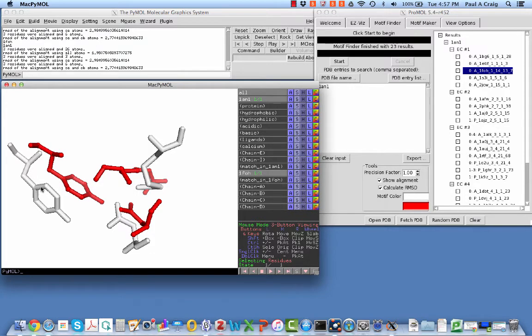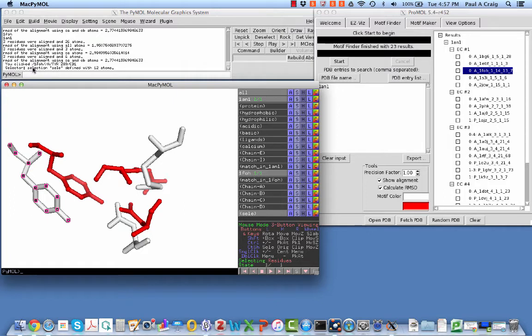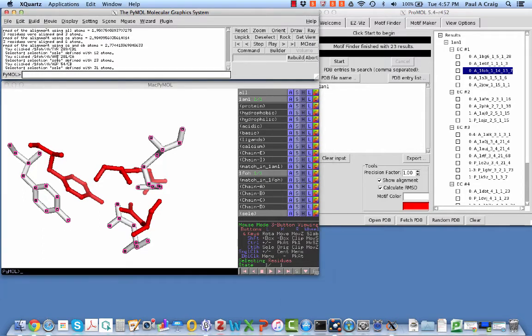So if I click on this tyrosine residue, if I look up now into the external graphical user interface pane, I can see it says you clicked on 1FOH, which is the PDB ID, A, that's the chain, tyrosine 289, and I actually clicked on carbon delta 1. And I can do that for all of the template residues. And we see that this template has an arginine and also an aspartate.